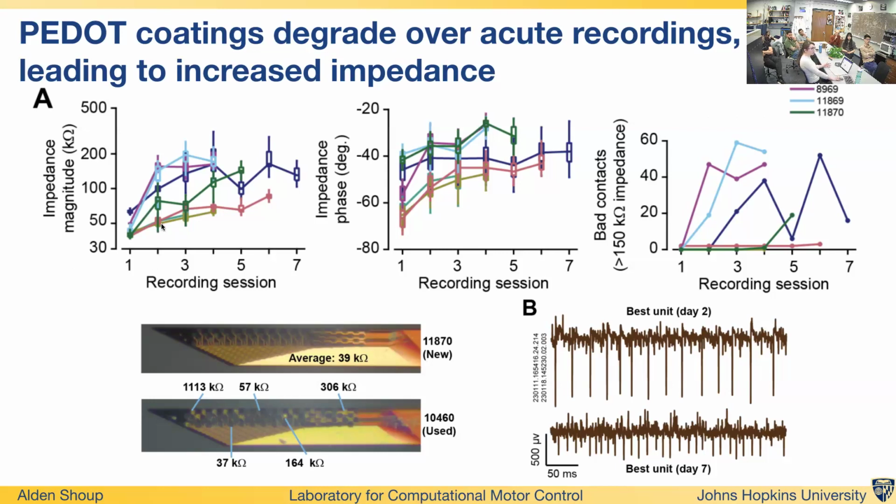And it gets to the point where you have almost a couple orders of magnitude increase from your base impedance in the magnitude spectrum. Well, I guess one more order of magnitude approximately. But in addition to that, you're also losing your capacitive properties as your phase increases.